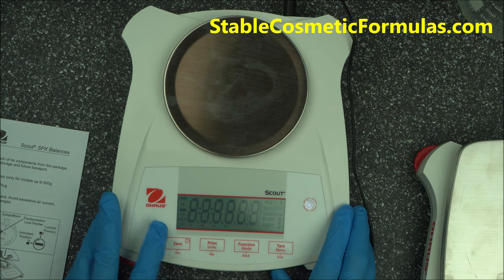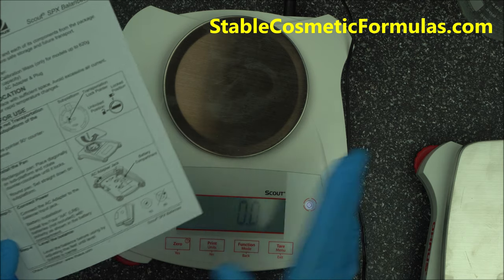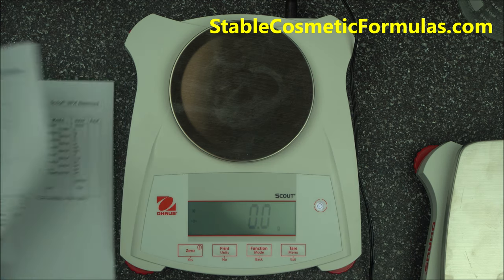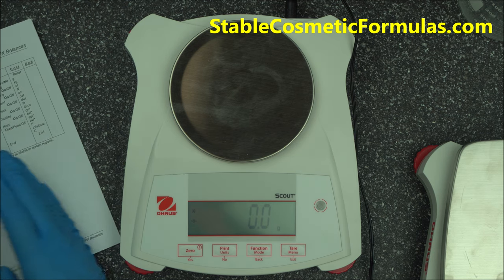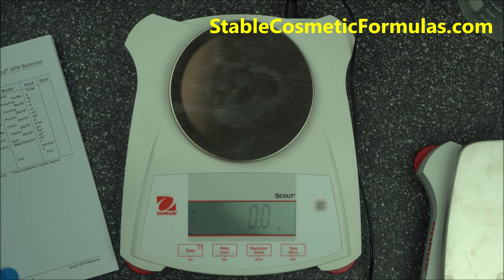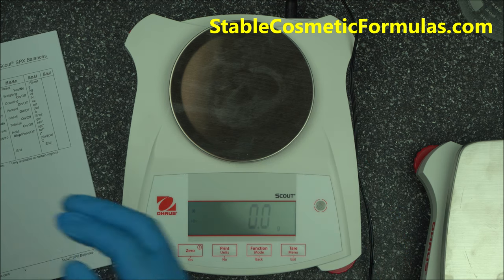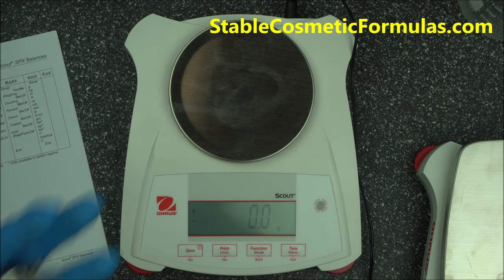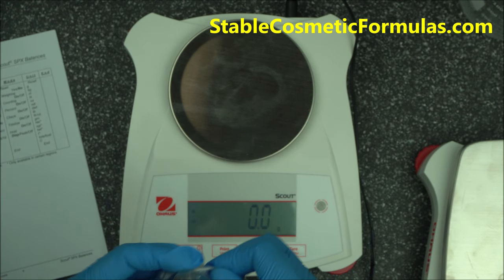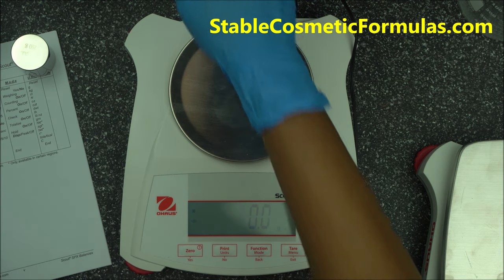When you first turn it on, you don't have much to do. Make sure you follow the instruction booklet — calibration instructions are on page four. It's very good that the SPX Scout 421 comes with a calibration mass. It comes with a 200 gram calibration mass, which you'll find in your box.